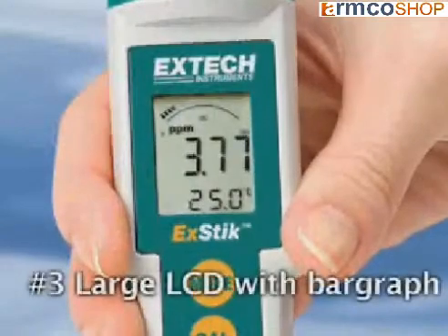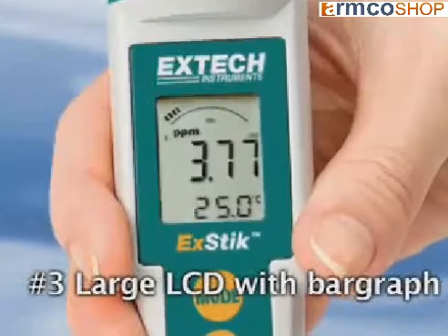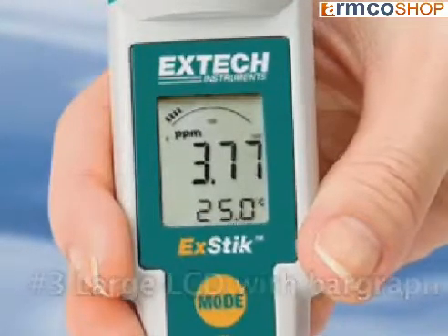Number 3. The large LCD displays the reading in parts per million, while the analog bar graph offers a visual graph displaying the amount of chlorine concentration in a sample.